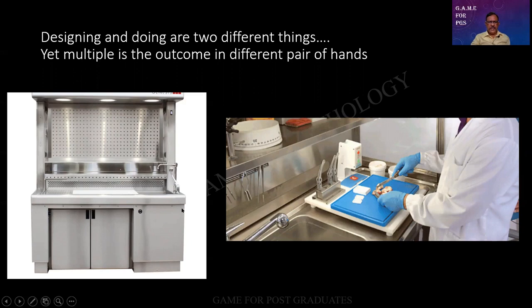A grossing station. These are all newly being designed and we should pay ample attention to all this. Whether there is a flow of water, whether you have got the containers, different sets of instruments are available, and so on and so forth. And then there has to be a grossing table as such, in which we do it. A lot of intricacies are there, which you people can learn from each other or from your seniors.